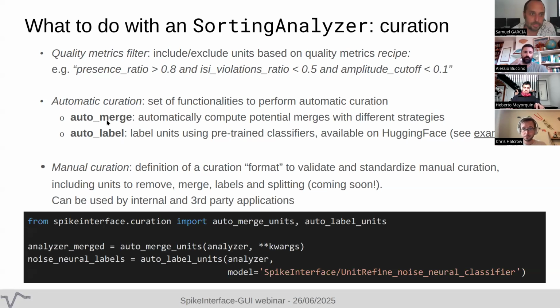More recently, people from the SpikeInterface team worked a lot on a tool which is auto-merging, so it makes merges automatically based on some criteria. So Aurélien Vignard, Alessio Buccino, Pierre Yger, and a bit of me worked a lot on this. So we have an internal tool based on the sorting analyzer and mixing many pieces of information. You can make some auto merges.